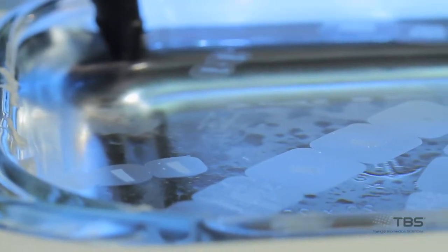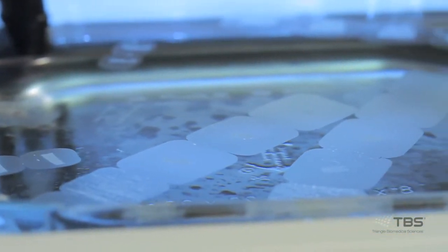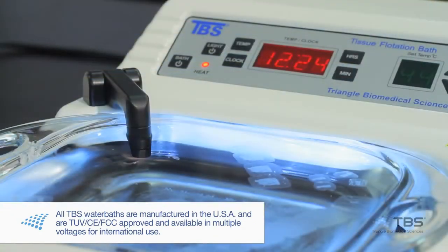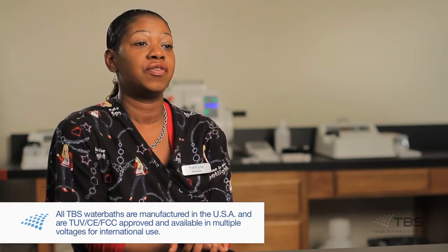My name is Tiffany Ferguson. I work for Associated Urologists of North Carolina. I am the histo technician in the pathology department. I worked with an older water bath and it was time for me to upgrade. One of the things that I like about the TBS water bath is the lighting — it reduces the glare and it increases tissue visibility.